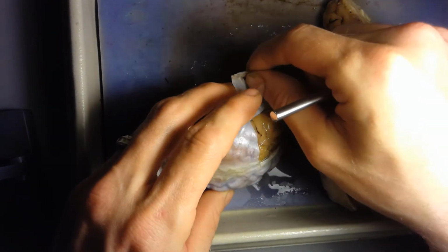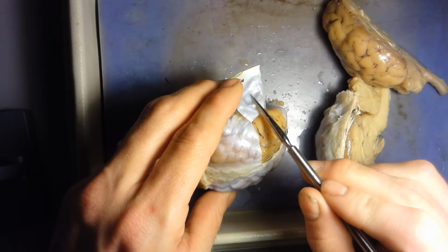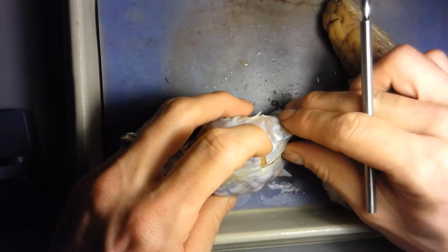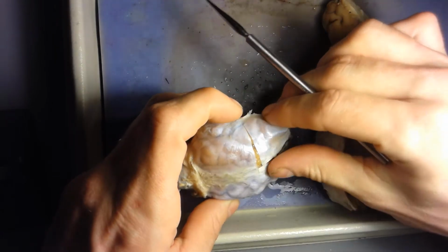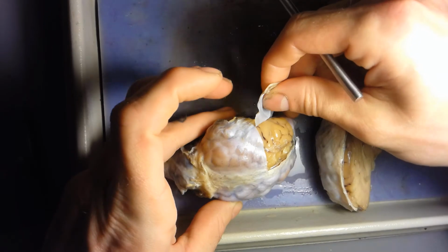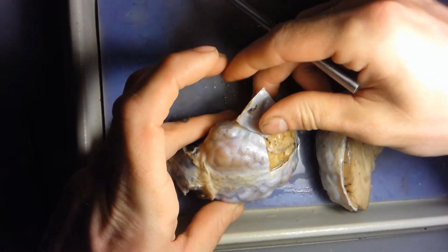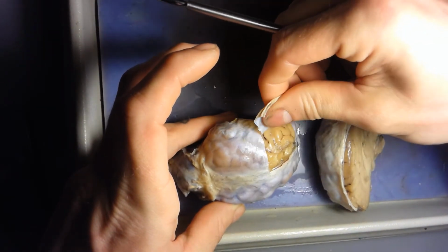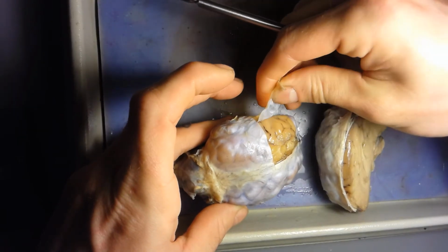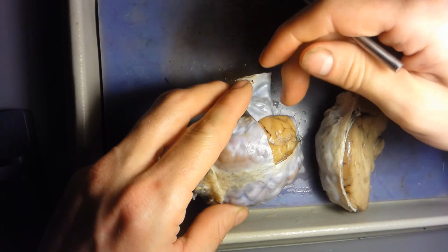If I flip this over, the inner layer is arachnoid mater. So dura, arachnoid mater. Now there's actually 2 tissues here, so if I rub my thumb and finger on it, you can actually feel the 2 layers rubbing up against each other. So there is a little bit of a space in between them.